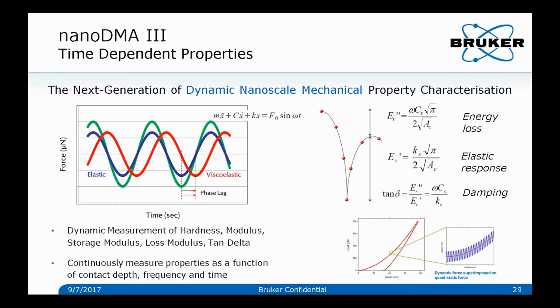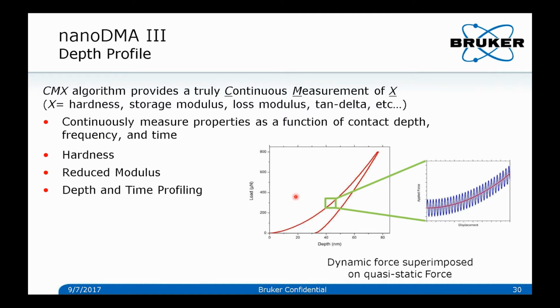The classic example here is a rubber ball that's bouncing. It bounces, and you lose some energy, so it bounces to a lower height. And you can think of this as the storage modulus is the amount that's recovered, whereas the loss modulus is the amount of energy that's lost during the bounce. So it's not quite analogous. There's many frequencies occurring when the ball bounces, whereas in our test we're focusing in on a single frequency, but essentially it's a rough analogy for the test that we're performing.